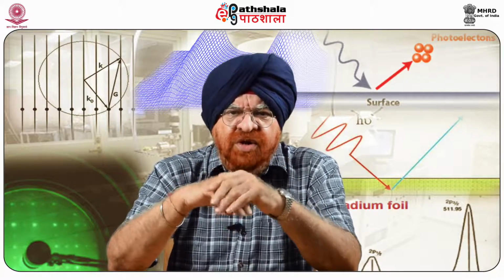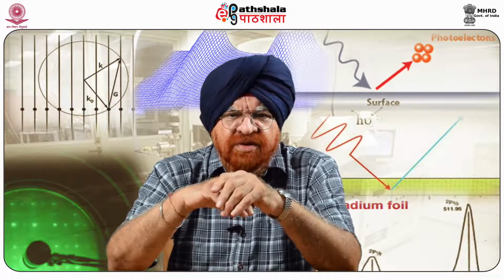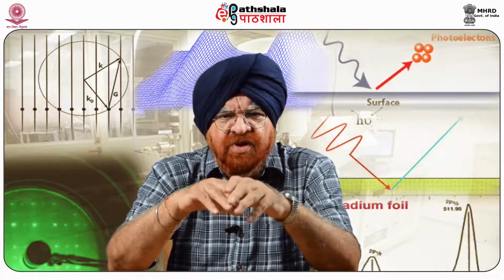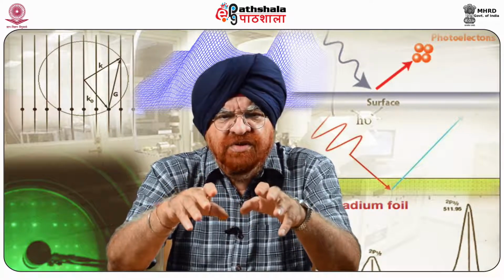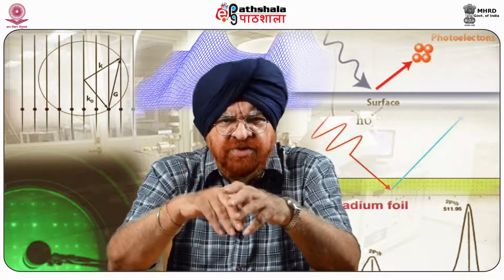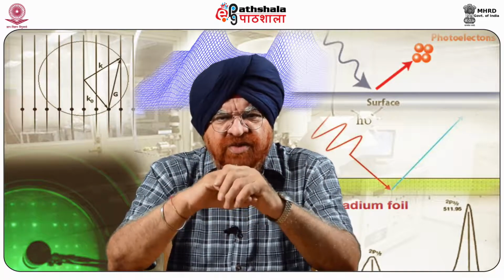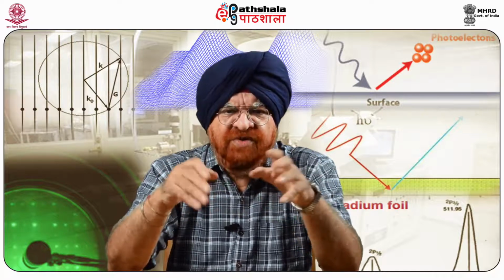In fact, to our knowledge, there have not yet been any demonstrations of atomic level details in biological samples, because those samples have larger molecules and it is very difficult to go up to the atomic levels.